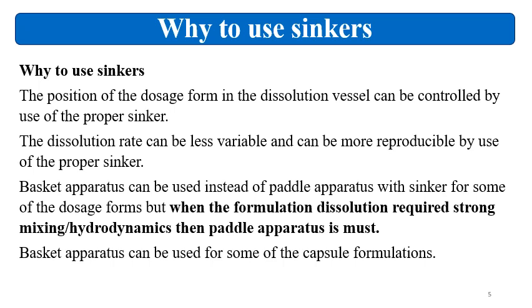So yes, basket apparatus can be used instead of paddle apparatus, but only for some formulations. If the formulation requires dissolution with strong mixing or hydrodynamics, then paddle apparatus is a must.